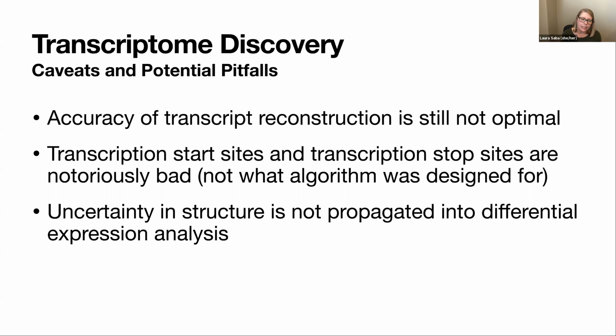And finally, from a statistics point of view, our uncertainty in the structure is not propagated into that differential expression analysis. So when we take all of these transcripts on to do statistical tests in, we're not treating the ones that we're super confident in any different than the ones that were novel and maybe there.